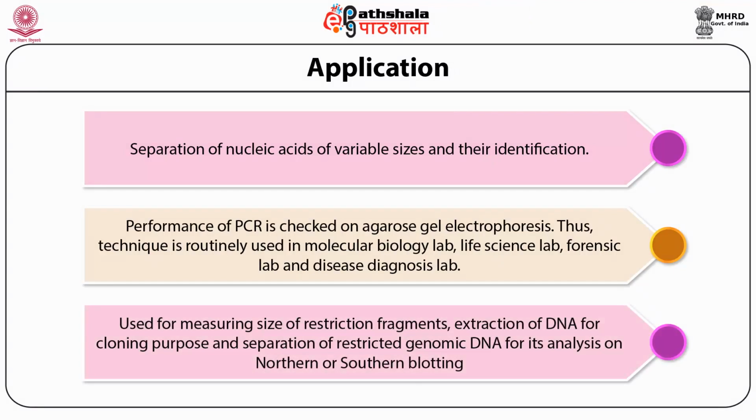This Agarose Gel Electrophoresis is always used in continuation of PCR reaction. So we cannot bifurcate the application of Agarose Gel Electrophoresis from the polymerase chain reaction. In a nutshell, we will say that all the applications known for the PCR reaction are in fact evaluated by the Agarose Gel Electrophoresis.